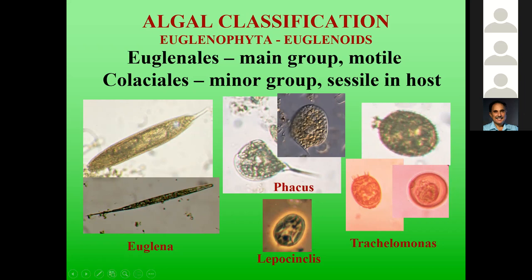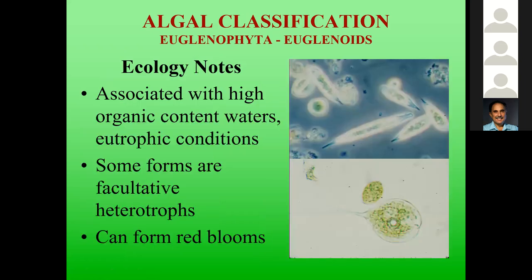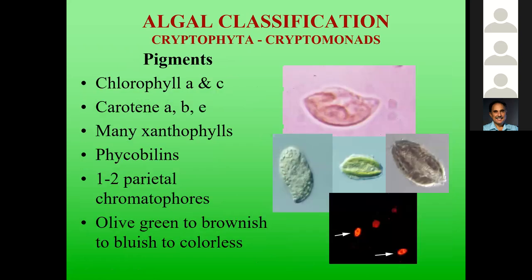Colacium lives only in the anal cavity of crustacean zooplankton. I like it a lot because if I'm having a bad day, I can remind myself I could be a Colacium. It could be worse. Again, high organic content waters for most of the euglenophyta.